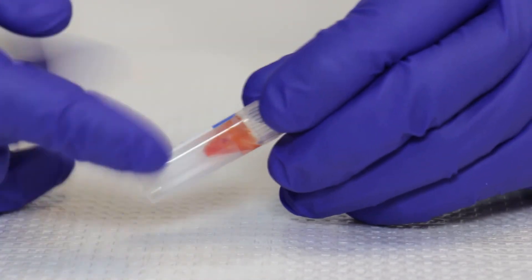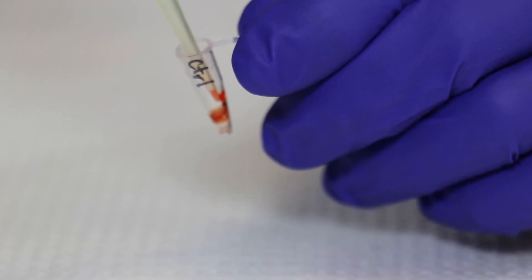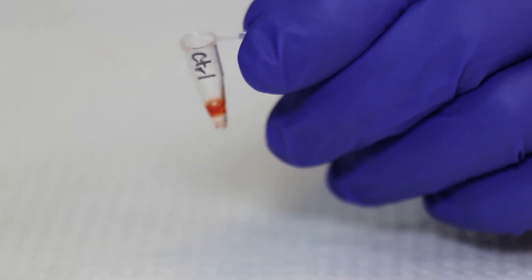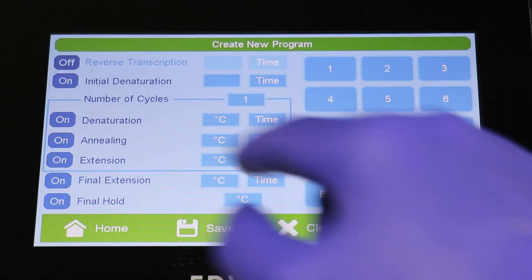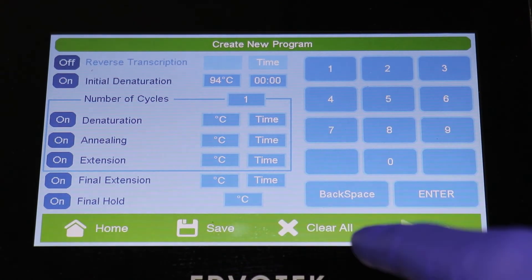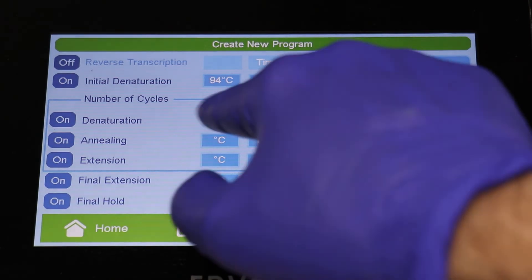The solution should be light red and clear of any solid pieces. Step 3: dispense 50 microliters of the diluted control mixture for each control reaction.